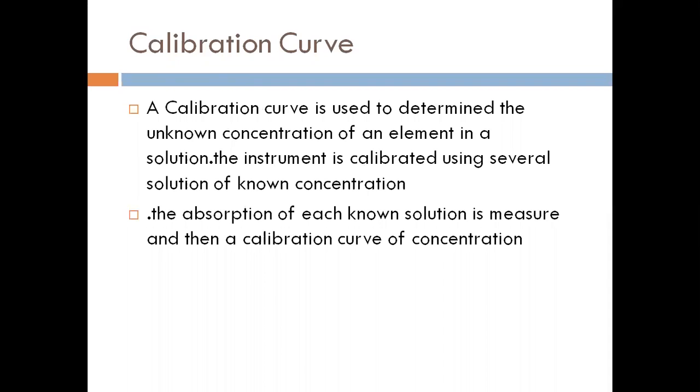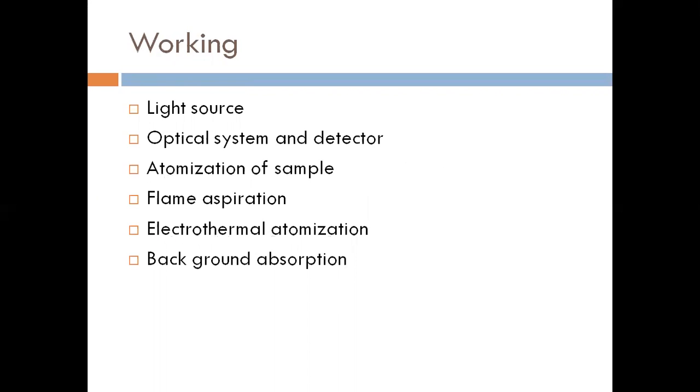A calibration curve is produced, which is continuously recycled as more concentrated solutions are used. The more concentrated solutions absorb more radiation up to a certain absorption. The calibration curve shows the concentration against the amount of radiation absorbed.